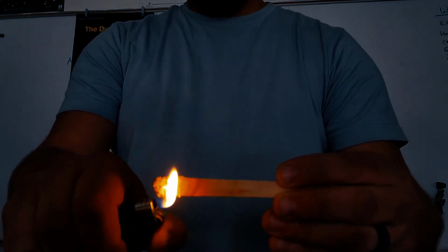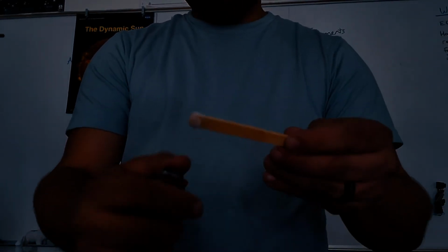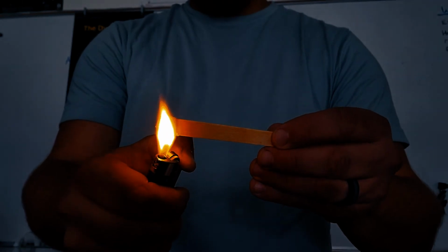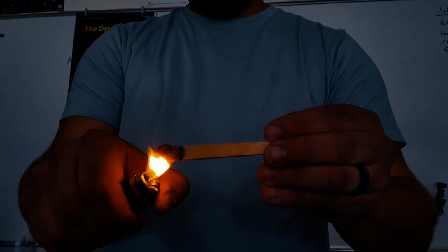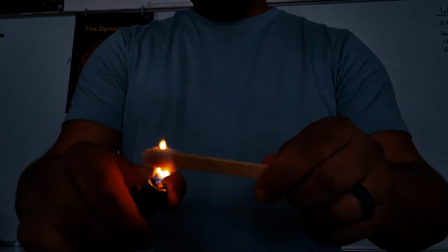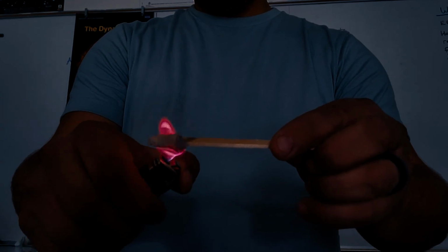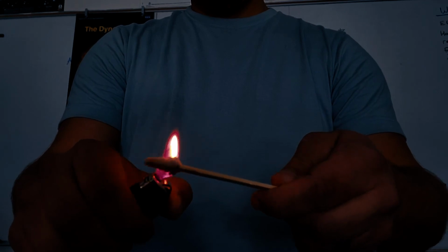And one interesting thing that I like connecting this flame test to, that's sodium chloride, so it should be burnt orange. The flame test reminds me of how our sun burns elements essentially and has a particular color. And when we look at other stars through deep space telescopes, they burn different colors. So then what does that tell us about elements and how they're related to the stars?